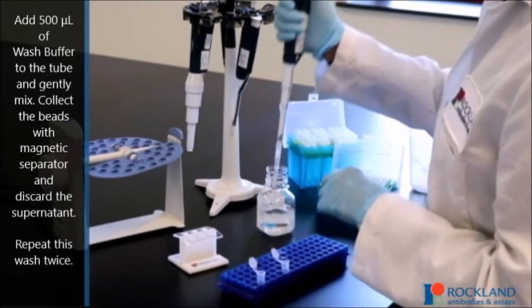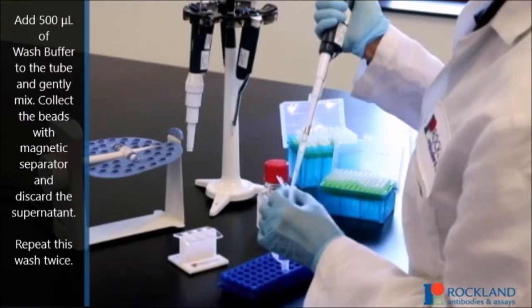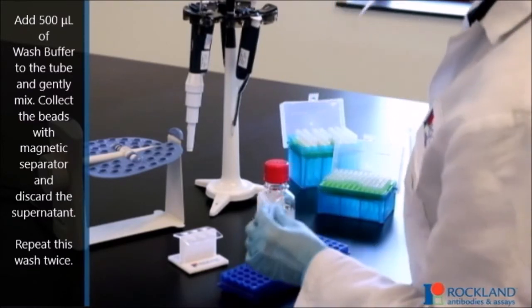Add 500 microliters of wash buffer to the tube and gently mix. Collect the beads with a magnetic separator and discard the supernatant. Repeat this wash twice.